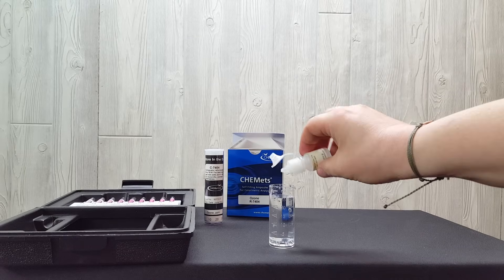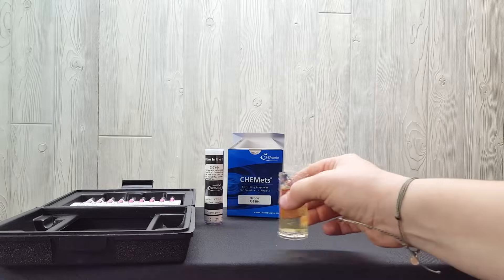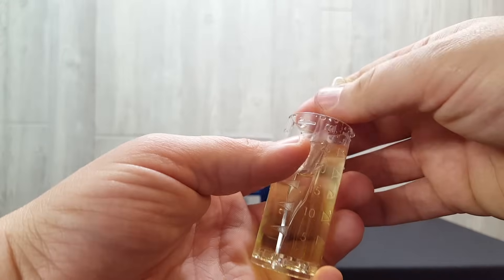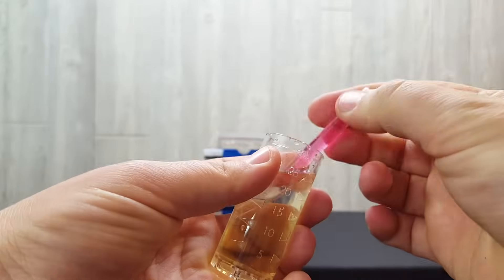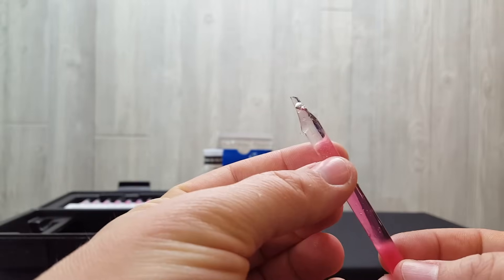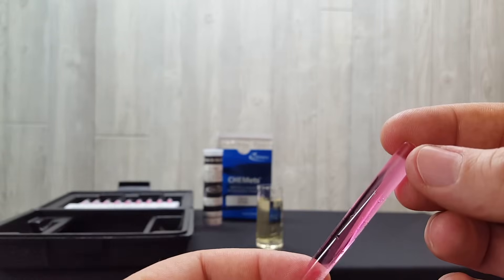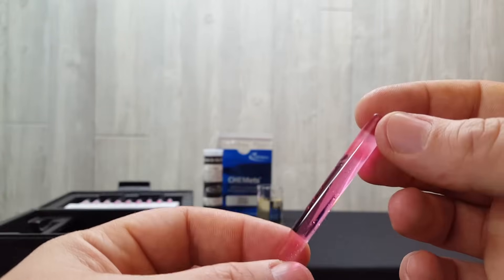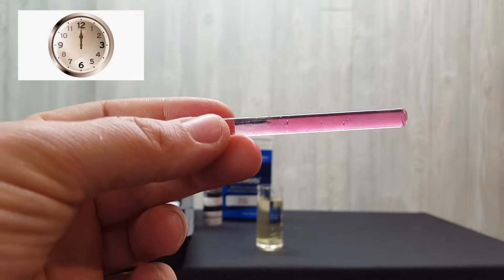Add 5 drops of activator solution and swirl it. Snap off the tip of the ampoule. Rotate the ampoule back and forth several times so the bubble moves from top to bottom and mixes the sample. Then wait one minute.